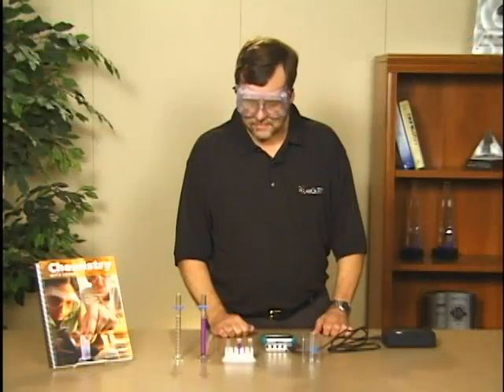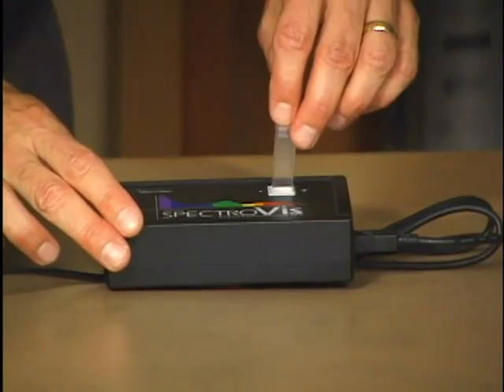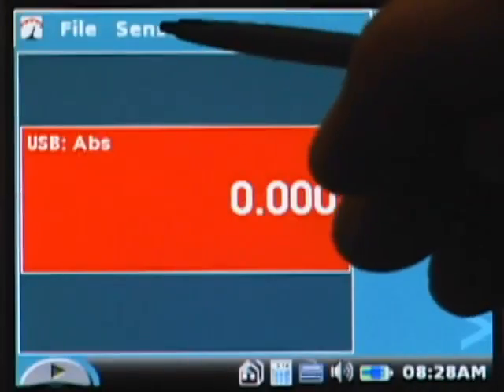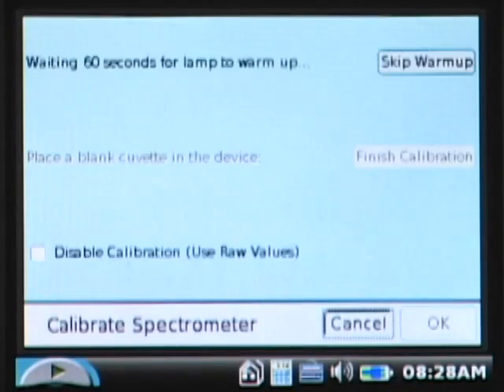The first step is to calibrate this just like you would any spectrophotometer. I'm going to take a blank cuvette, place it into the cuvette slot of the spectrometer, then tap on the sensors menu and choose 'Calibrate USB Spectrometer.' That briefly turns off the spectrometer light source and performs a zero percent transmittance calibration across the entire spectrum from 400 to 725 nanometers.